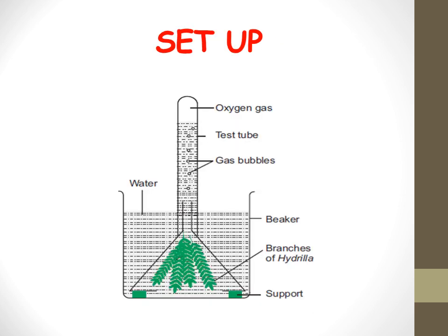Here we have the setup. We have hydrilla twigs placed in the stemmed funnel in this way. We have to provide support under the funnel so that the water does not block it. We can see that oxygen bubbles are coming from the stemmed funnel.